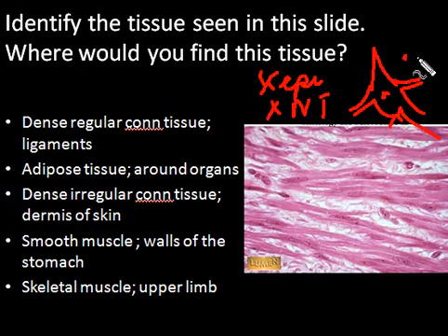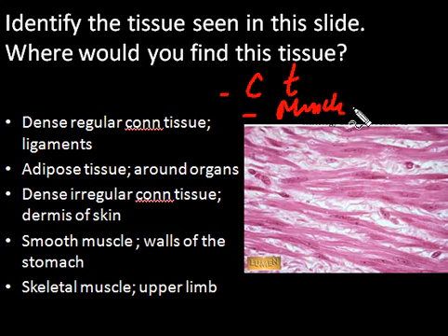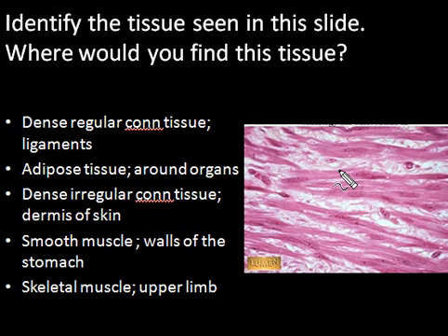so there'll be many of these, plus the nuclei of neuroglia, so that looks very different. So it's not that. So the only possible choices you have is it is either connective tissue, any form of connective tissue, or it is muscle tissue. Now the difference between the two is you have to look at the nuclei, where they are placed, and you have to look at the cell. If you look at this image and you look at this particular nucleus along with the cell in which it's lying, you can see that it's lying in the center of the cell.